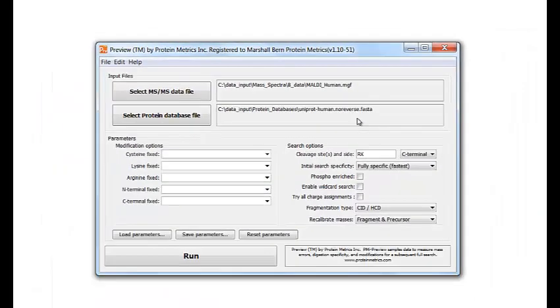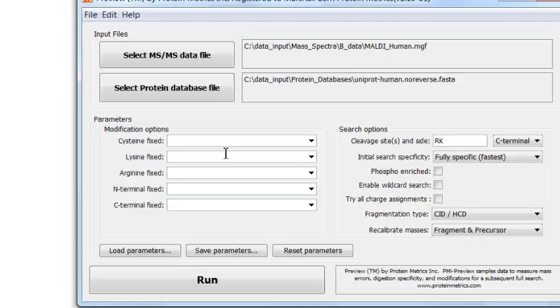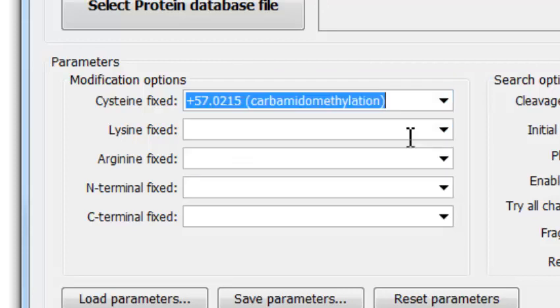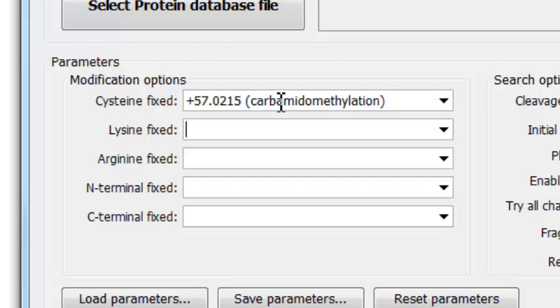There are also some optional inputs. Over here, you set the fixed modifications. This sample was reduced with DTT and alkylated with iodoacetamide, so I will select carbamidomethylated cysteine. You can also type in the mass of the fixed modification. If you don't know the cysteine modification, leave the space blank, and Preview will try all the most common possibilities.